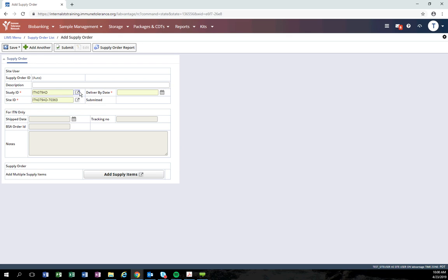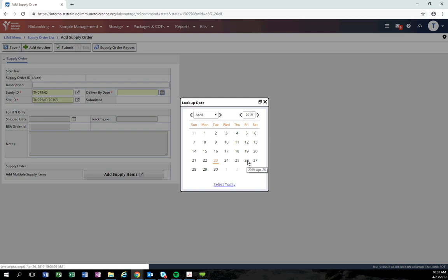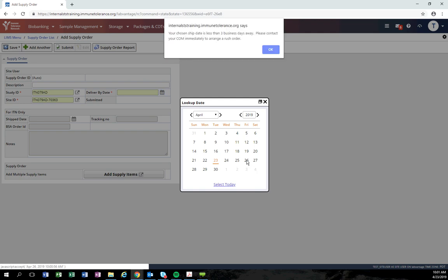The third required field is the deliver by date. Click the calendar to enter the date you need the supplies delivered to your site by. If you select a date within three business days, that is considered a rush order. The system will open a warning window.